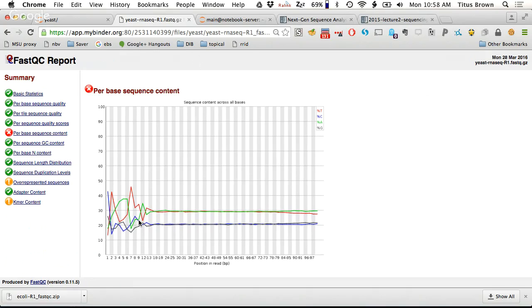It turns out if you map your RNA-seq reads back to the reference transcriptome and look at these positions, these sequences are correct in general. There's not a higher incidence of errors here. What's actually happening is that RNA-seq has a bias in where the reads are starting in the transcriptome. And that bias, in this case, I believe, has been tracked down. I have to make sure to put this link in, but I believe it comes from biases in the cDNA priming of the reverse transcription of the fragments, right?